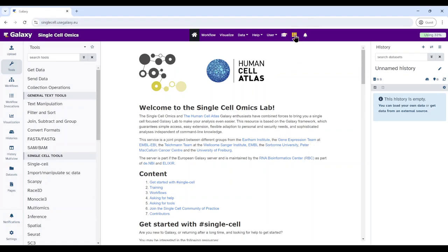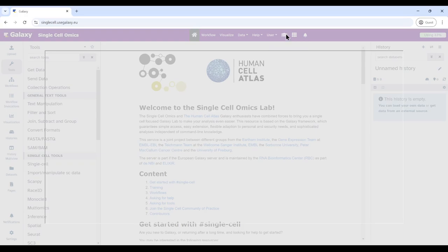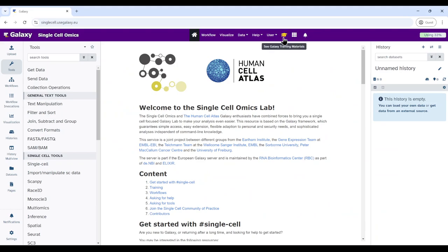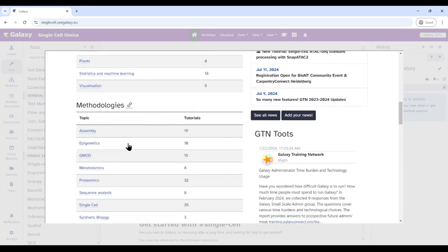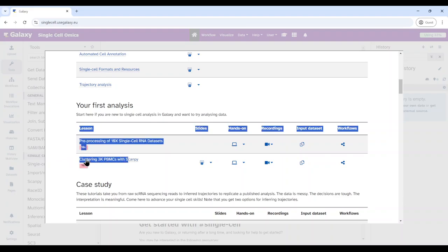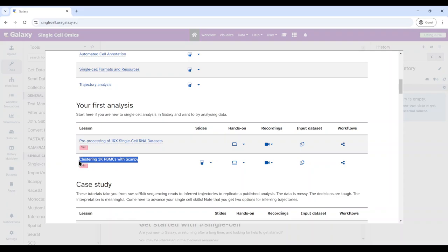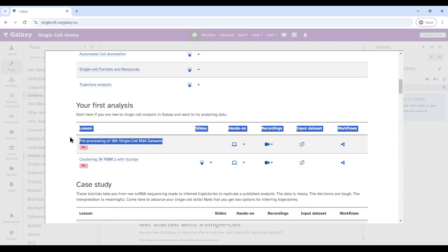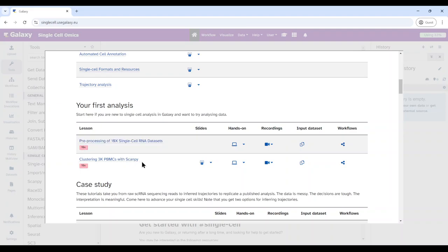The first thing is to open the training material. I usually open it from inside Galaxy. To open this, click on the hat icon, then go down until you find the single cell topic and click on it. Today we are going to do the clustering 3K PBMC tutorial with ScanPy. If you haven't run this tutorial, please look at it — it's a preparation for our current tutorial, and you need to have a filtered, high quality quant matrix ready. This produced the input data for our current tutorial.